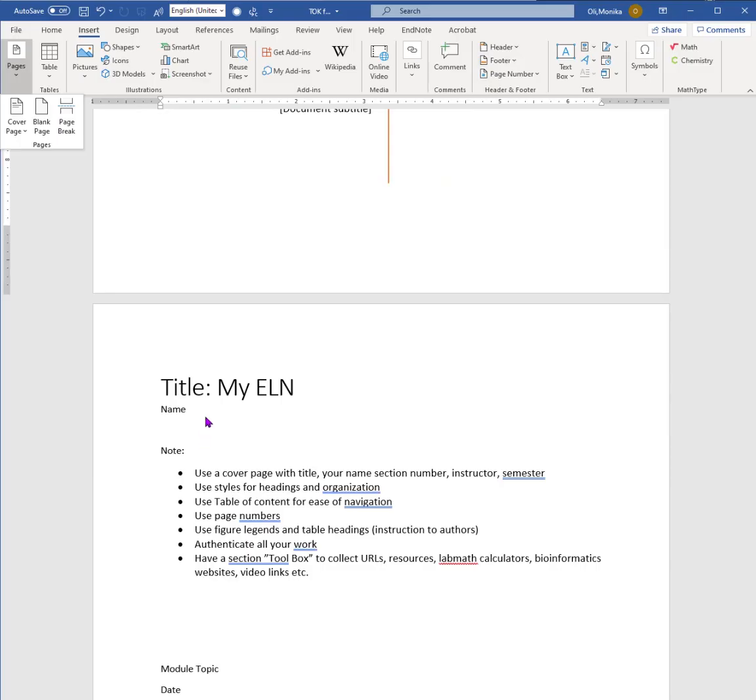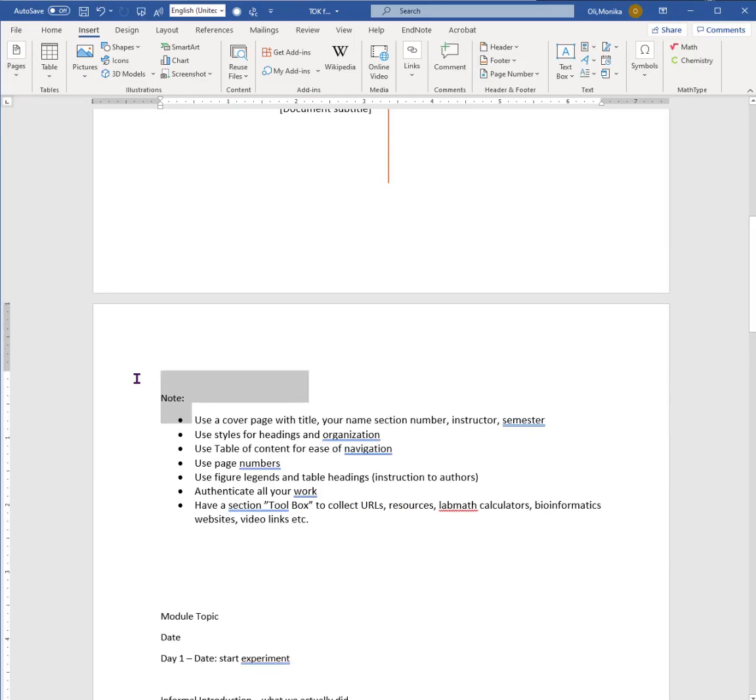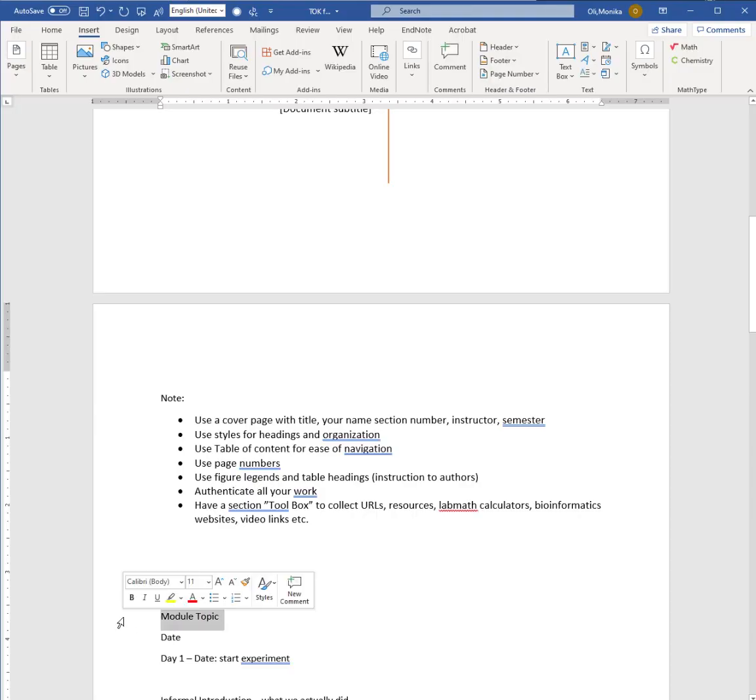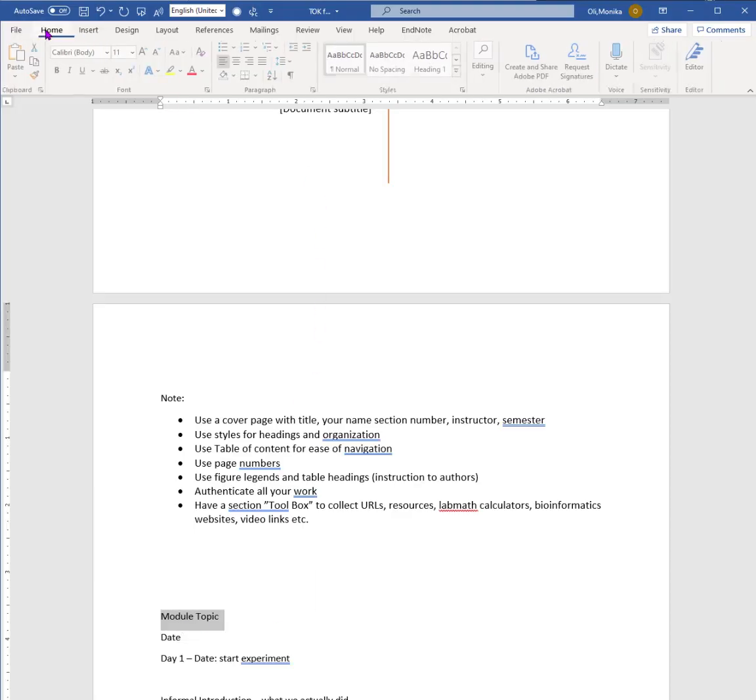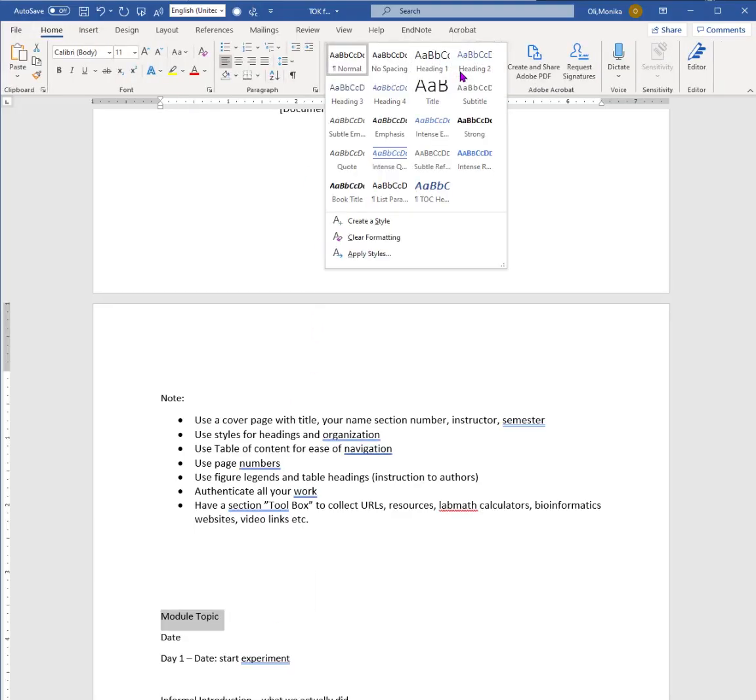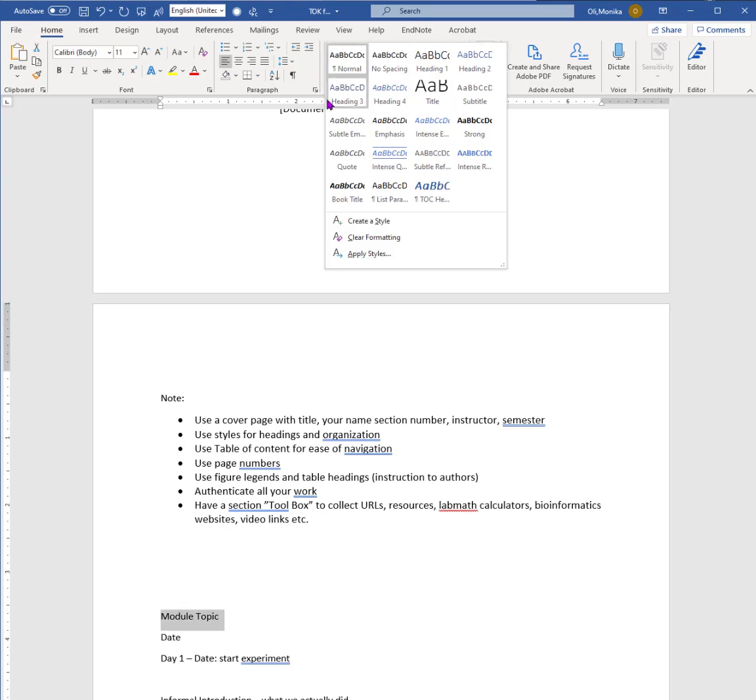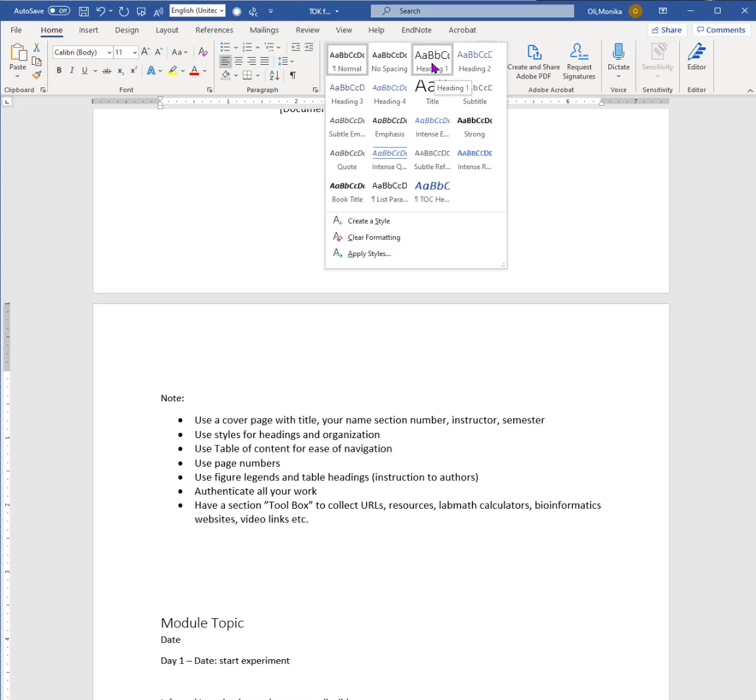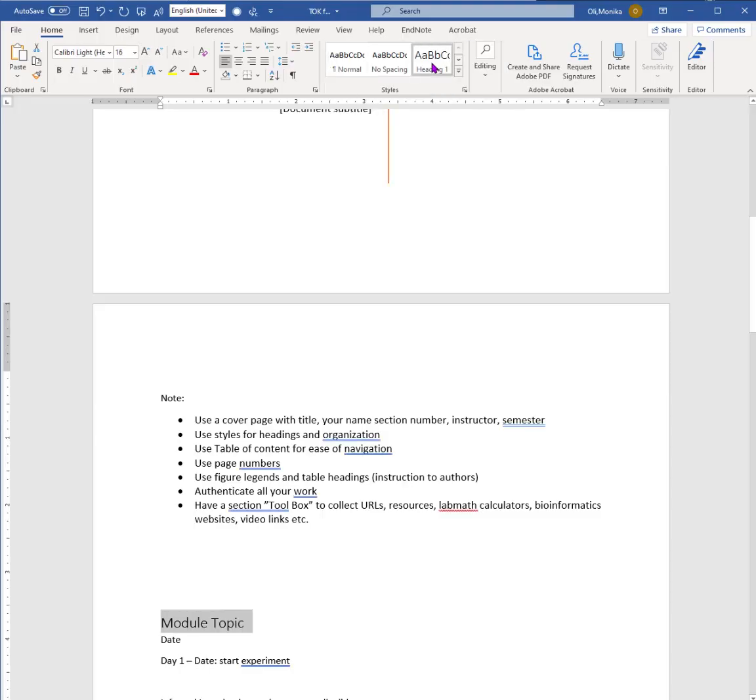Let's first need to do styles for each of the topics. For example, the main topics throughout will be always style heading number one. So again, if you do the drop down you can choose your different headings. If you don't like it there are different types of colors as well you can pick and choose.